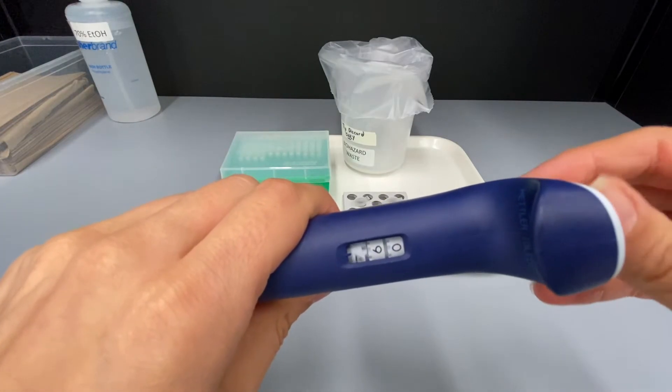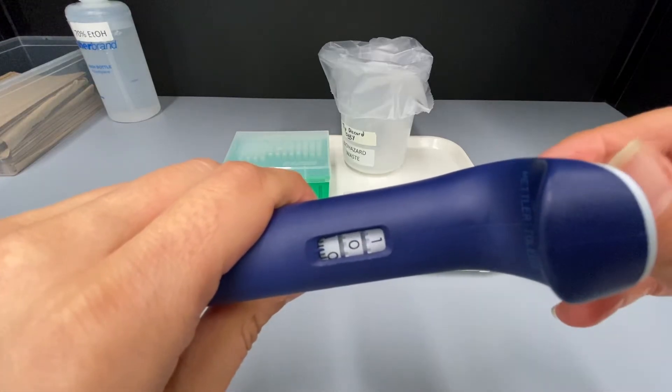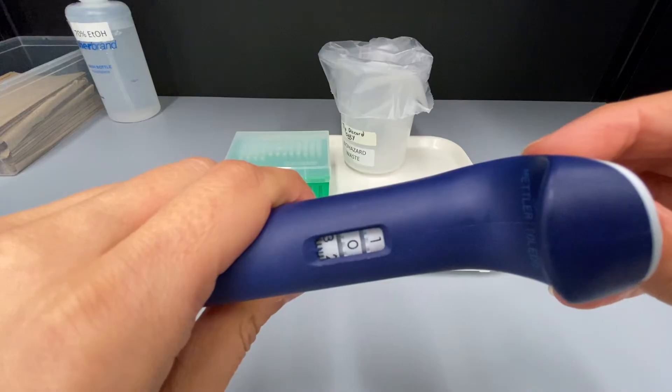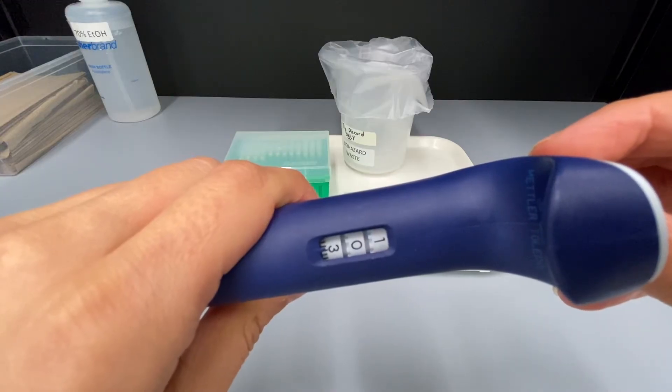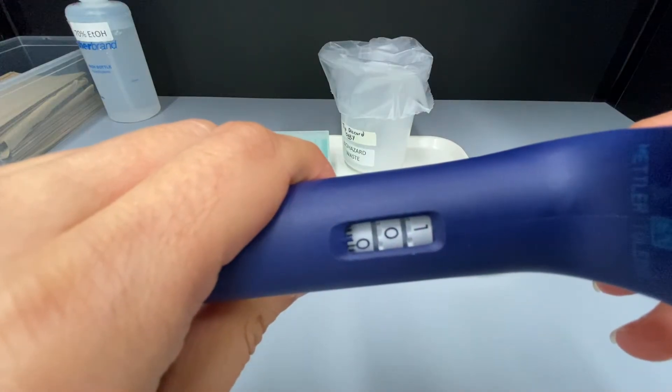When setting volume, it is recommended for accuracy to go past the volume required and then go back. So if the volume is not at 100, turn the volume adjustment knob until the volume reads 1, 0, 3 and then go back to 100.